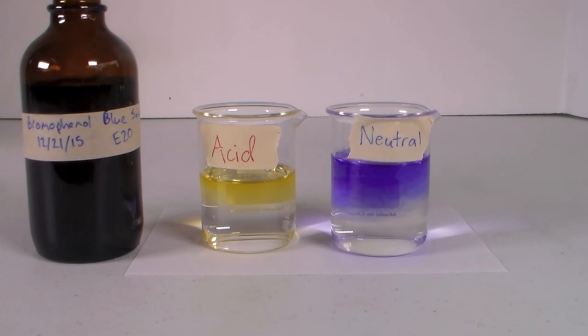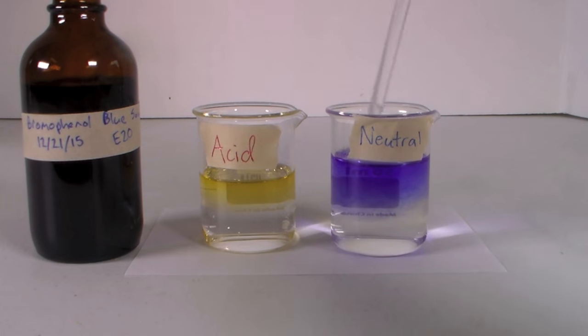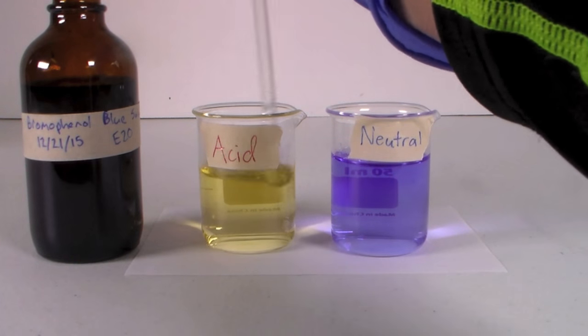This is because bromophenol blue is yellow when the pH is below three and blue when the pH is above four point six.